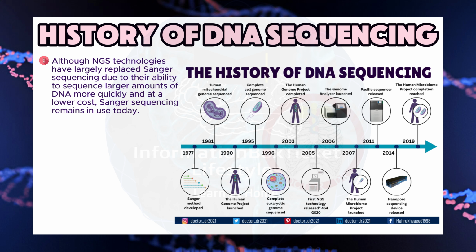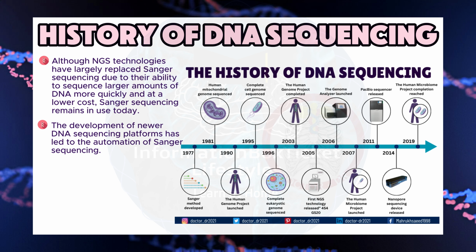Although NGS technologies have largely replaced Sanger sequencing due to their ability to sequence larger amounts of DNA more quickly and at a lower cost, Sanger sequencing remains in use today. The development of newer DNA sequencing platforms has led to the automation of Sanger sequencing.